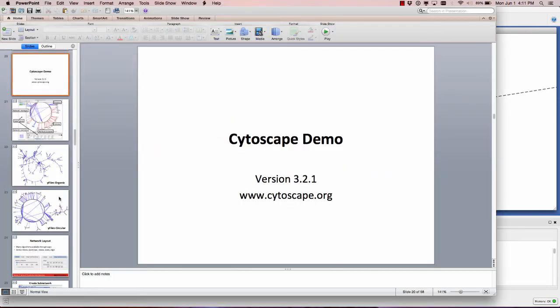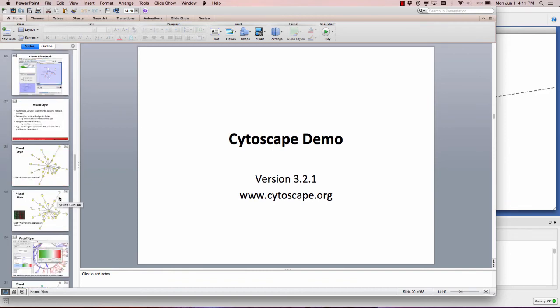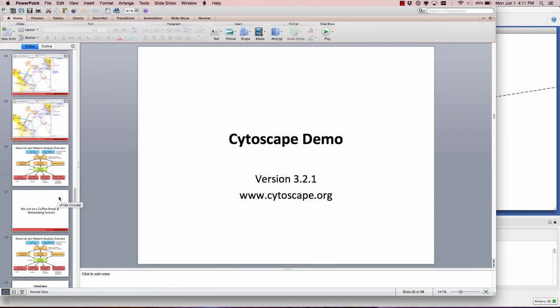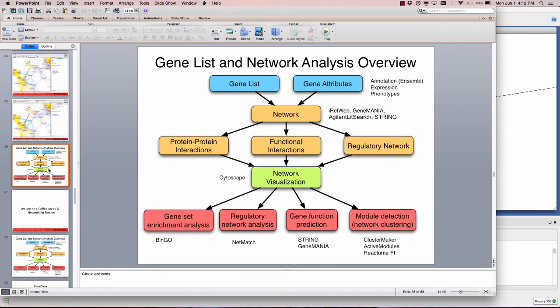The next slides are mostly screenshots from Cytoscape for reminder purposes. There's an old workflow showing how to get information into Cytoscape in different ways - you can have a gene list converted to a network with tools like Genemania, or load different types of networks. Cytoscape is used for visualization, and then there are different apps - for instance, there's an app called Bingo that does the pathway enrichment analysis we talked about today. There's also a text mining app that allows you to type in a set of genes, search PubMed for abstracts relating to those genes, and extract a network from those PubMed abstracts.